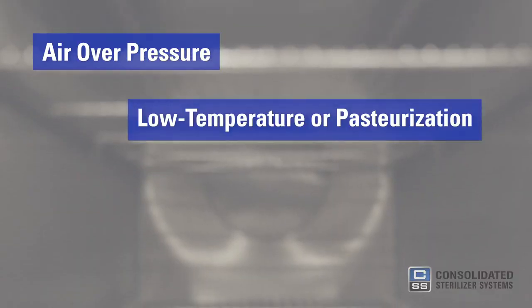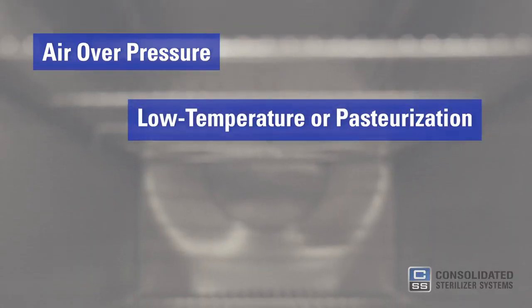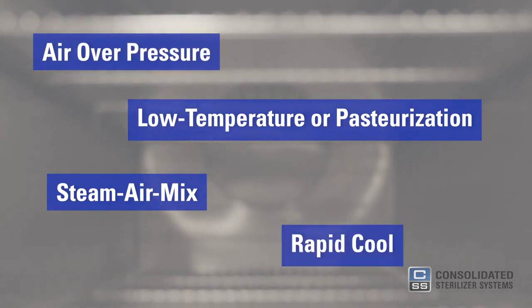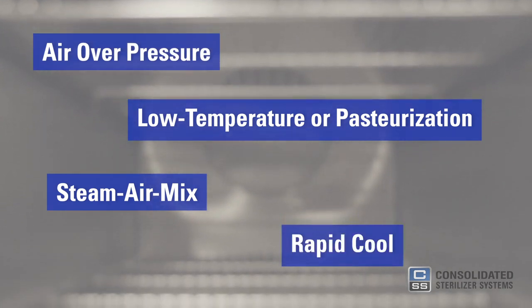It's worth noting that some laboratory autoclaves can perform specialty cycles, such as an air-over-pressure cycle, low temperature or pasteurization, steam-air mix, and rapid cool. Most of these cycles are for goods that are sensitive to prolonged steam exposure.